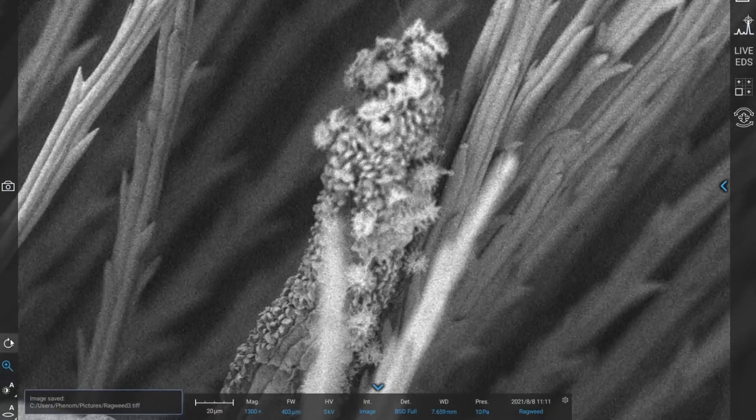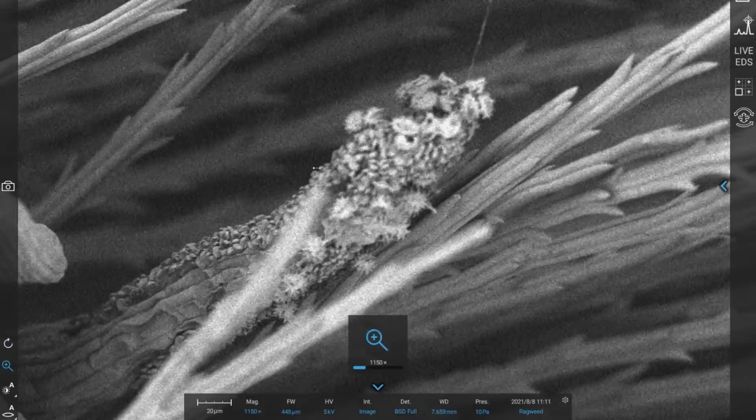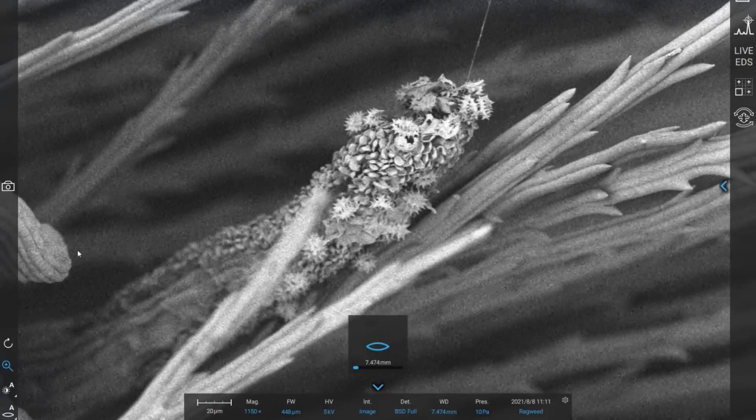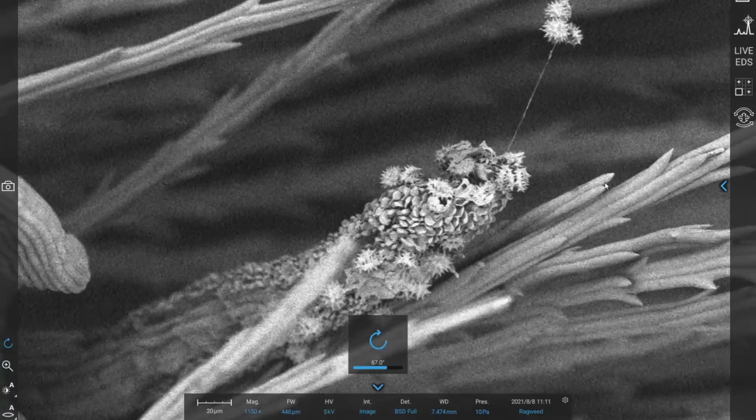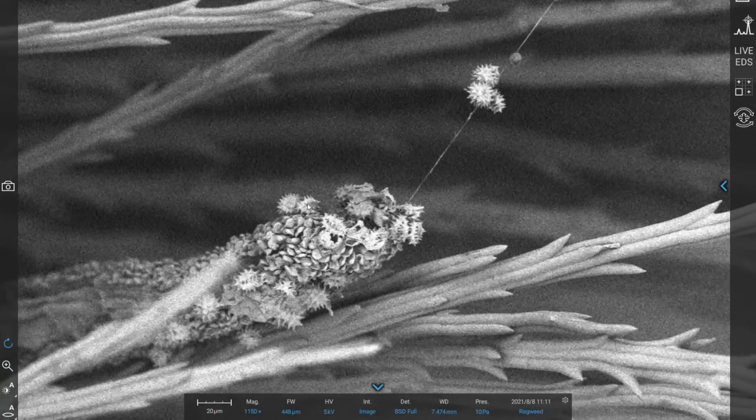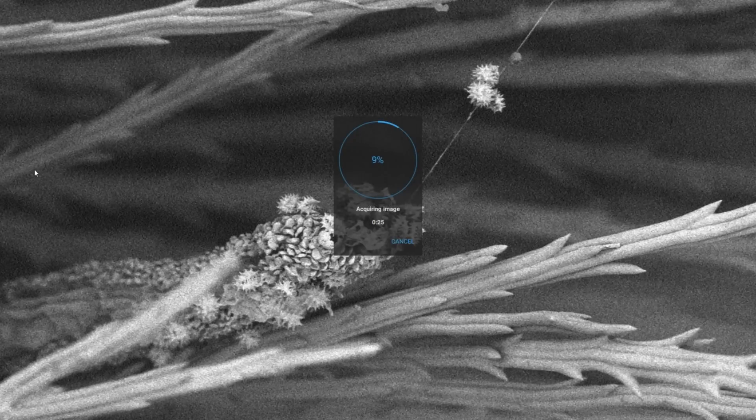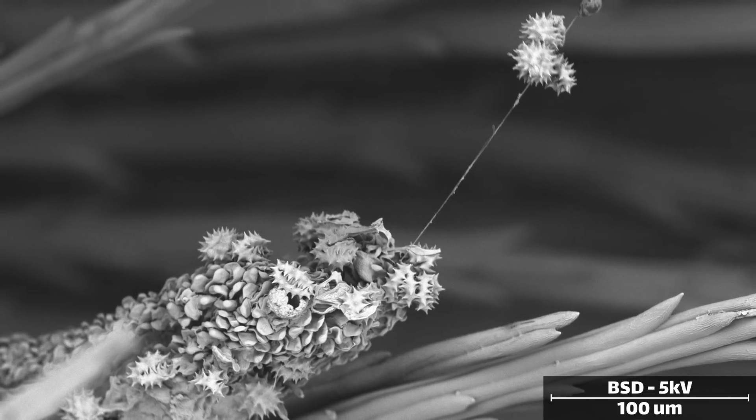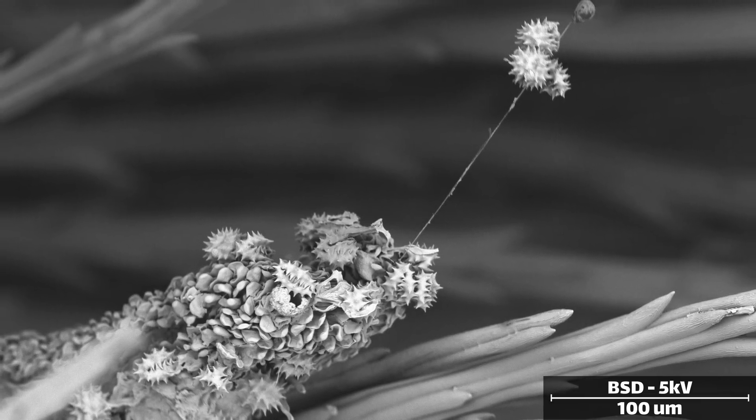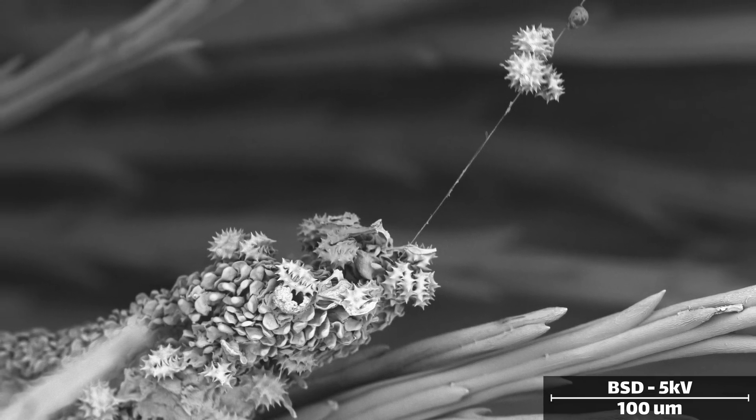Goldenrods are pollinated by insects - bees, wasps, hornets, and the like - which means their pollen needs to be relatively heavy and sticky so that it adheres to the insect. If it was light enough to blow on the wind, it would be blown right off the pollinators. Because of this, goldenrod pollen has a very distinctive spiky appearance.